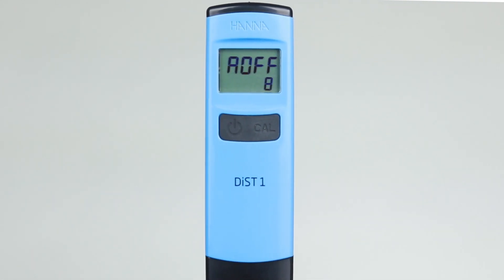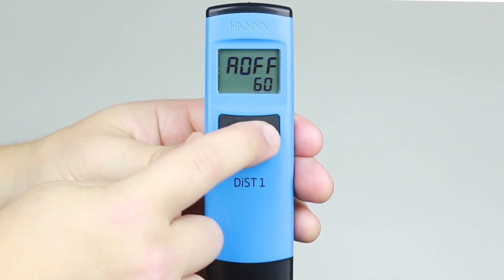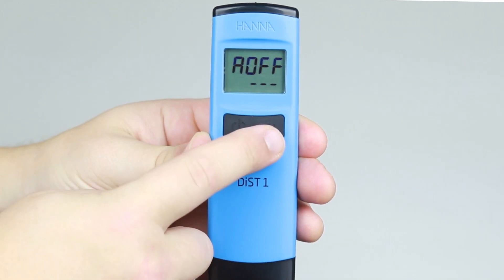The default setting for automatic shutoff is 8 minutes. Pressing the CAL button cycles through to 60 minutes, then disabled, and finally back to 8 minutes.